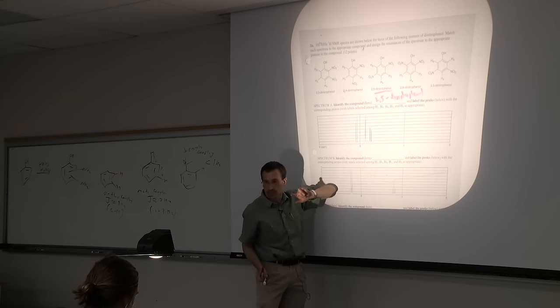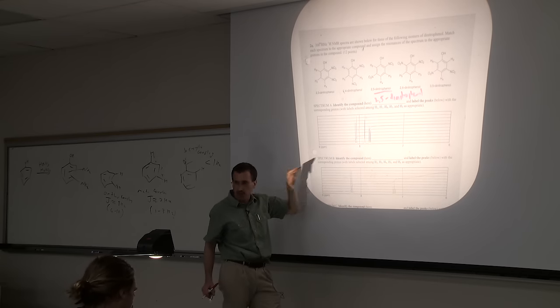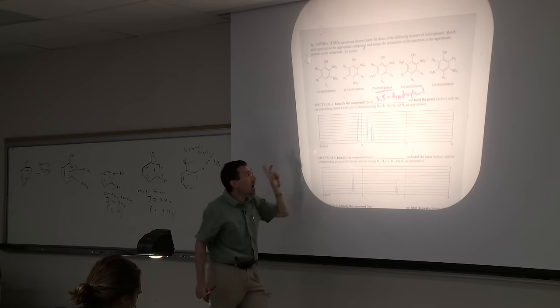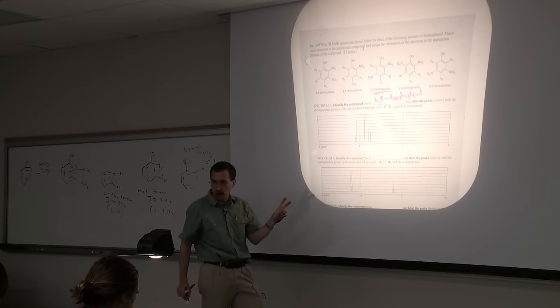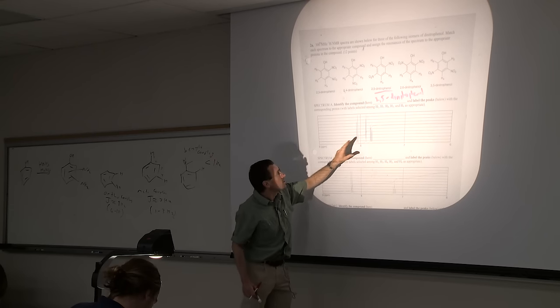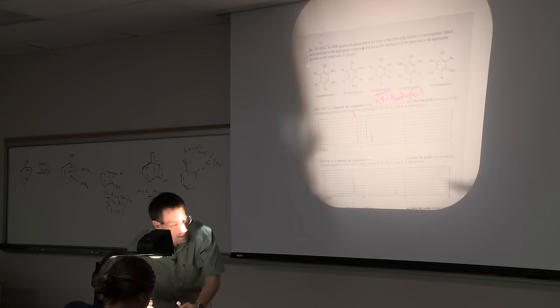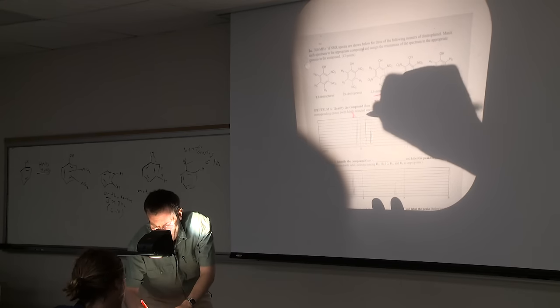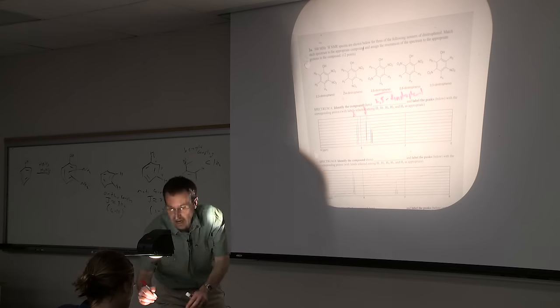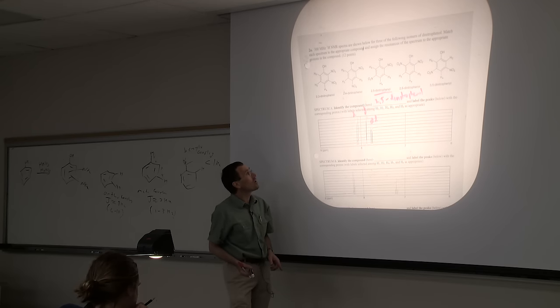And let's look at the patterns. These are, again, the Aldrich spectra taken on 300 megahertz NMR spectrometers, where 1 part per million is 300 hertz, 1/100 of a part per million is 3 hertz, and 0.03 parts per million is 9 hertz. So if you look at our pattern, we've got a doublet. We've got another doublet, but with a much smaller coupling constant. And we've got a doublet of doublets with a big coupling constant and a small coupling constant.